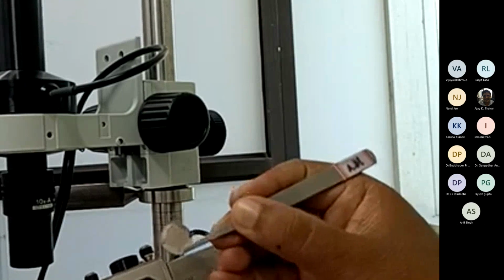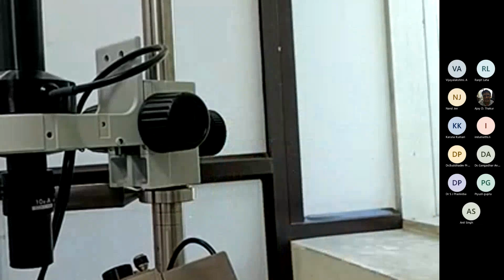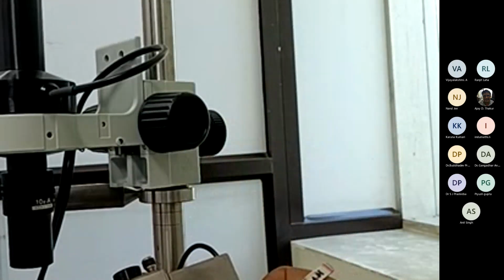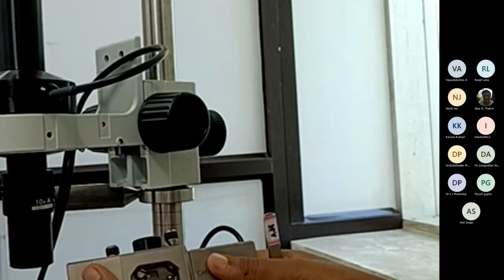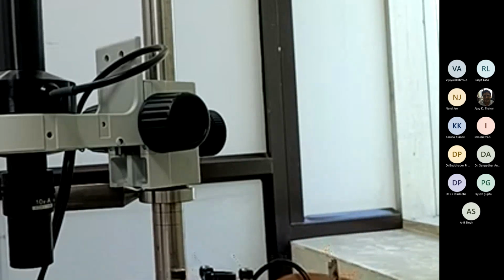This is the sample. It's gold coated mica. It is at the conducting base, and we put this base here, and this is our piezoelectric scanner. When we start scanning, basically this oscillates. It moves up and down, and at the same time it does the raster scanning also. Instead of the cantilever, our base moves in our design. Means Bruker Multimode 8.